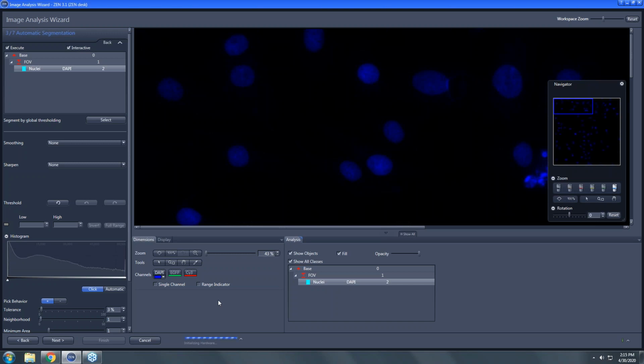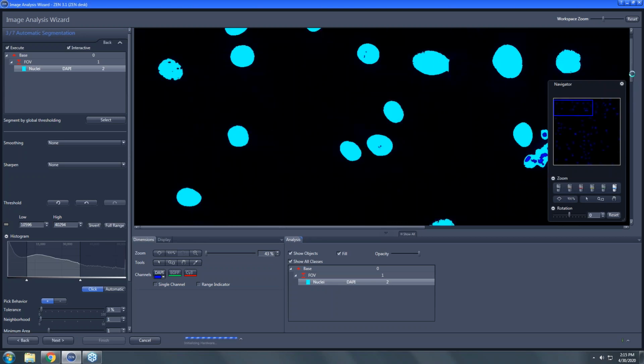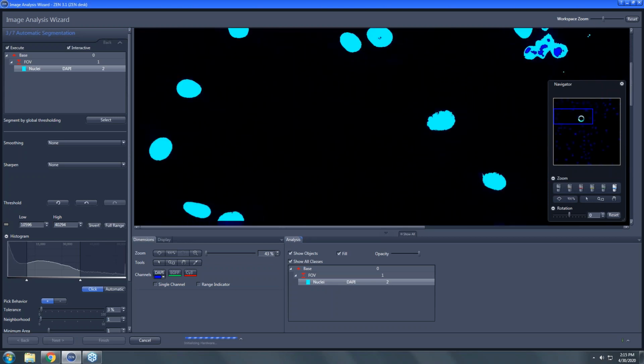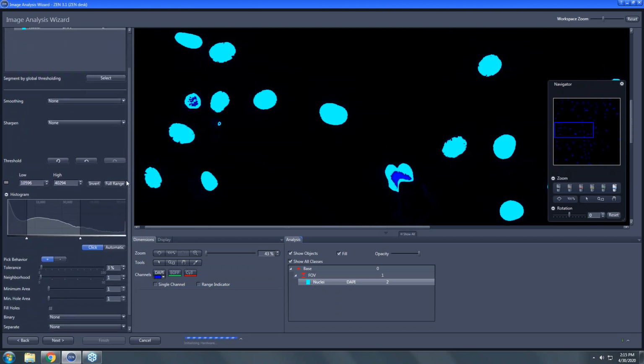And as she clicks on the nuclei, the value of the pixels underneath where she clicks are going to be included in the range of acceptable values. So as she clicks around, that range will get bigger and bigger, and we will see more and more pixels that are valid, which means more and more nuclei. Terrific. Having done that, we can see our nuclei are set. We're good. But I do want to point out on the left-hand side of the image here, halfway down this image segmentation window, we have the thresholds that we've set.